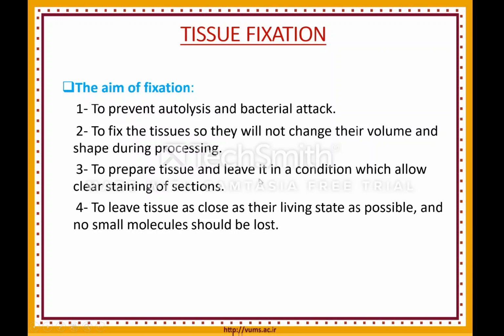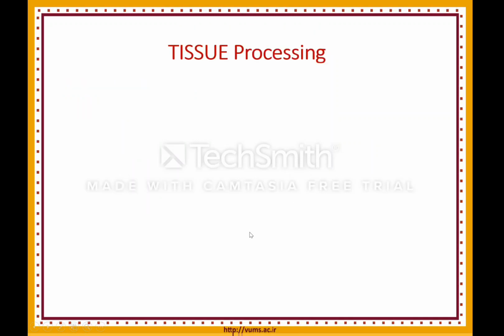Prepare tissue and leave them in a condition in which we are able to stain them in the session, and finally leave the tissue as close to its living structure as possible, and after that be able to study them. And also in this fixation, not a small molecule should be lost.